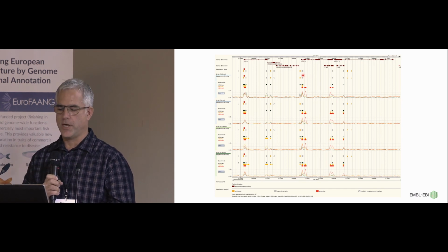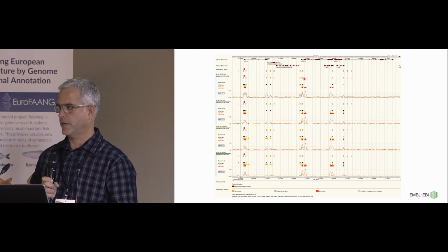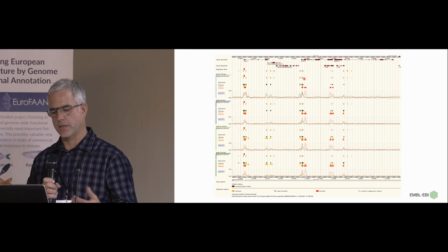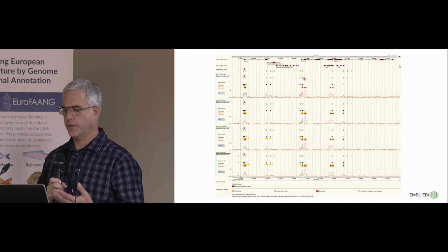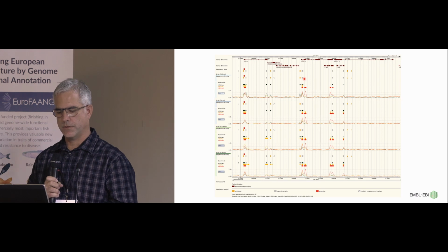So you might want to consider this as functioning like a promoter. Don't take the classification as not needing interpretation. It's a guide to help you find things of interest, and then by looking at the primary data, you can understand what exactly it's doing in the tissues of interest.